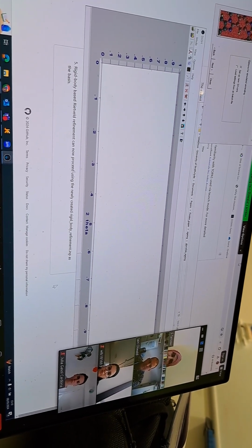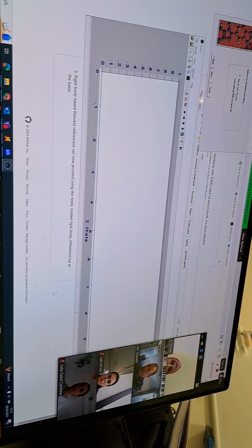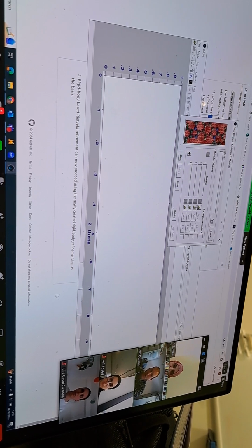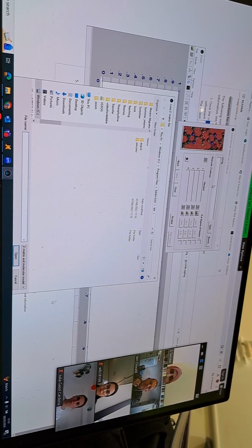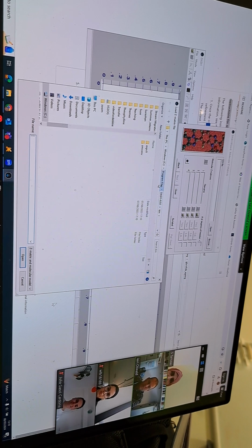So within Dash, we've got this new setup, simulated annealing runs, and we can click on to this. And here, what we're wanting to do is, I don't think you even need an SDI file then. Well, I guess you don't need to do it. Last week we did. For some reason, we don't this time.